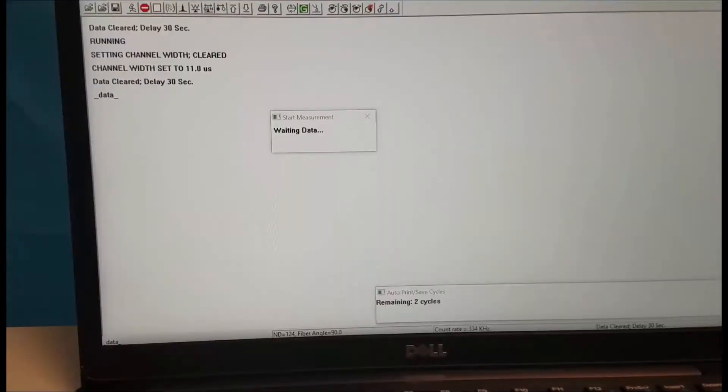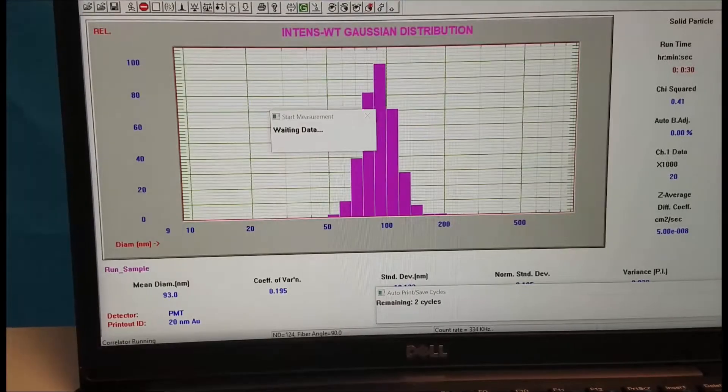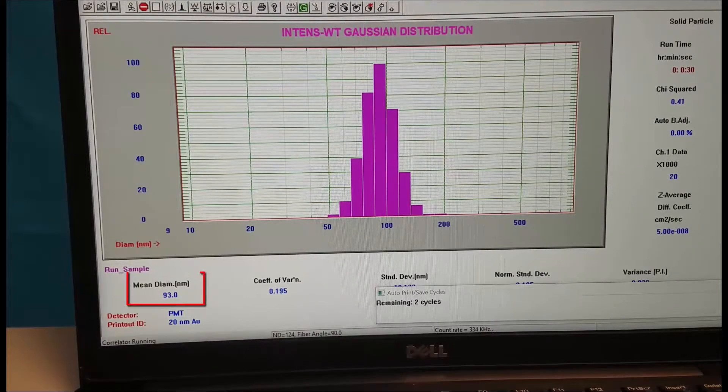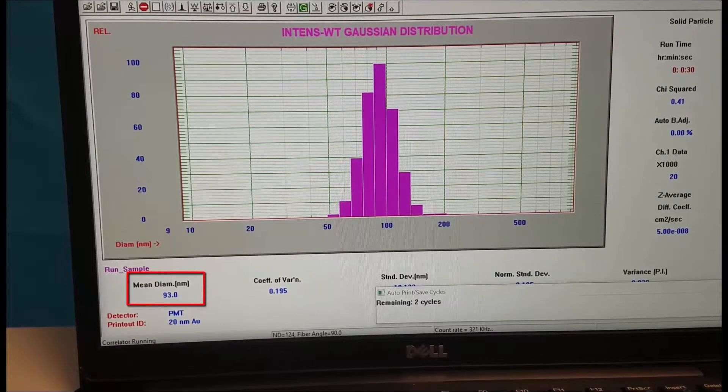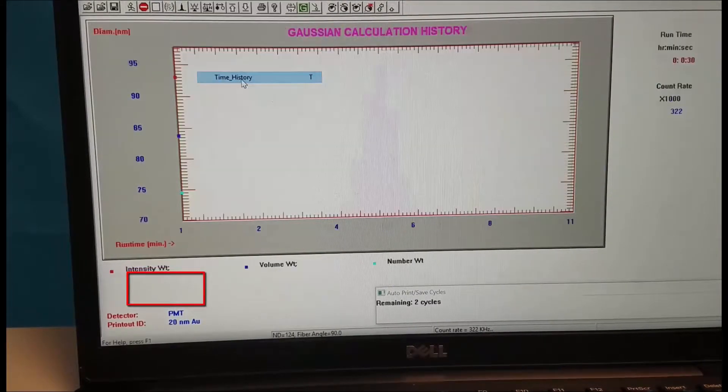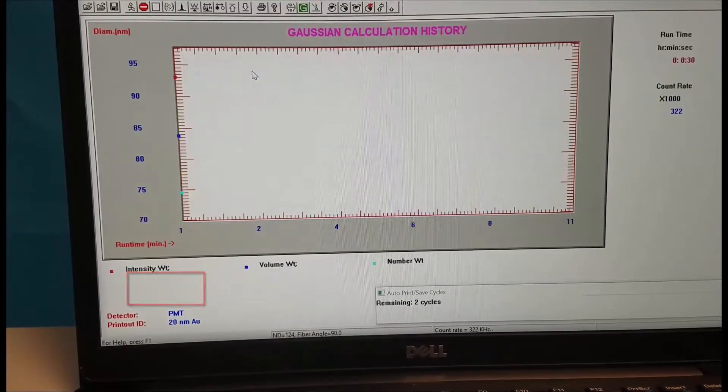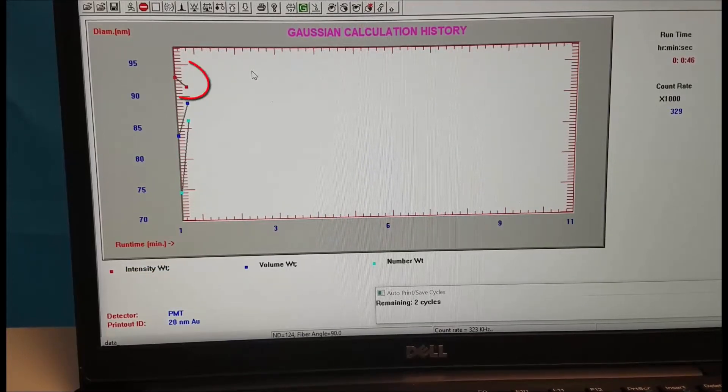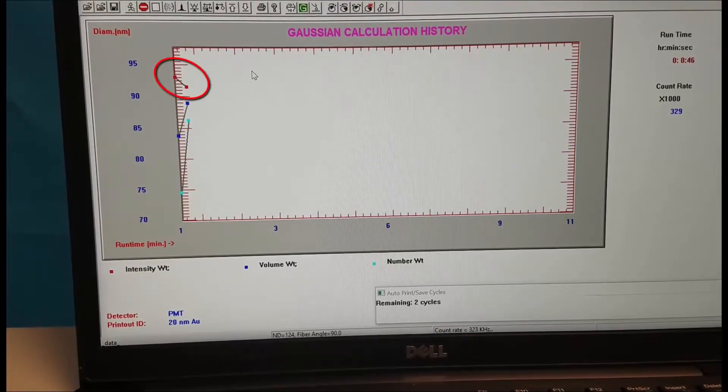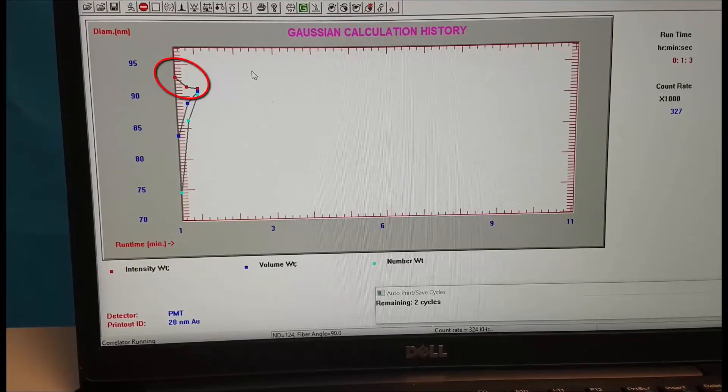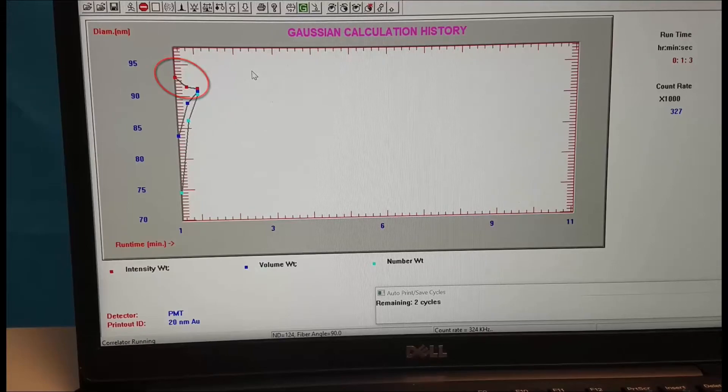After a few minutes the size will start appearing on the screen, see 93 nanometers. We can click on display and come down to time history. Here we could focus on this red value, the intensity weighted mean, and we want to make sure we measure for long enough for that value to have stabilized.